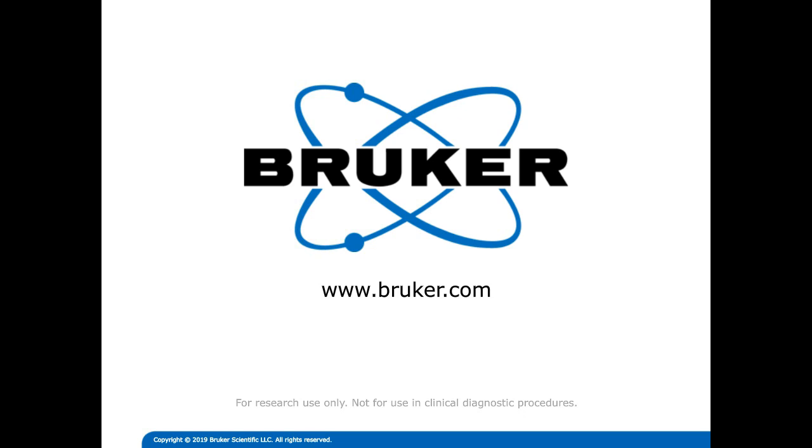Another question that came in asked, can one of the shown instruments differentiate between PS-PO exchange and an AG exchange? Sorry, what was that question again? Oh, that's okay. Don't see that one.